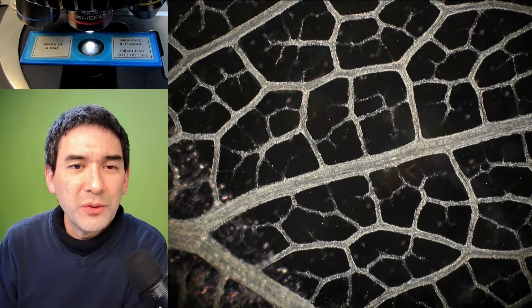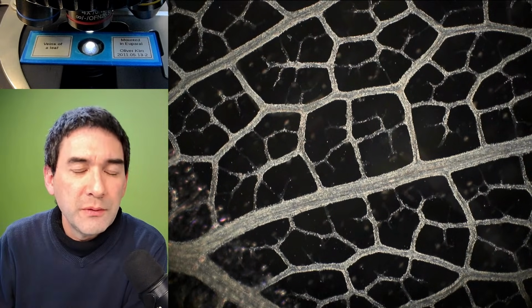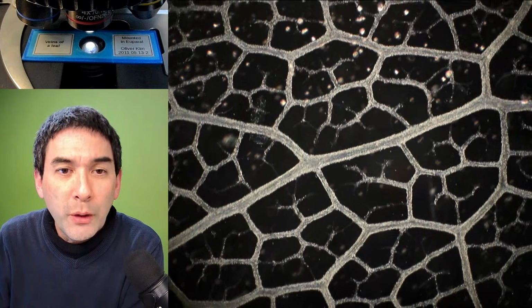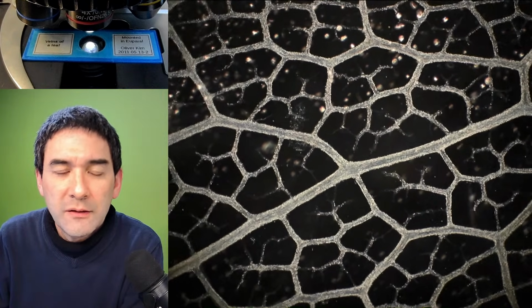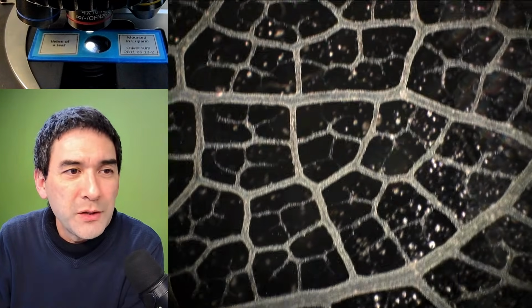And look what's going on here. This is now dark field, and this was quite a long preparation. Maybe some of you do remember this from a few months ago. I had to boil the leaf, and then I had to strip off all of the loose cells. For this reason, this is also one of my favorite ones, because it shows a little bit of the beautiful patterns of nature.